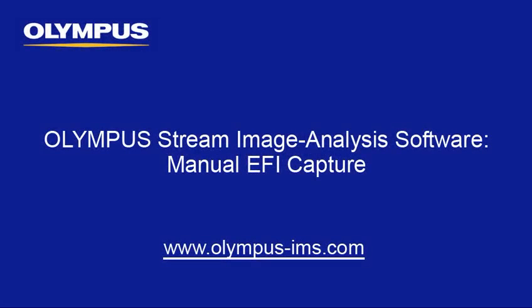This tutorial is one of many instructional videos presented by the Olympus Industrial Equipment Group. This tutorial video will provide you with detailed instructions to capture EFI, extended focal images, using manual focus within the Olympus Stream image analysis software.